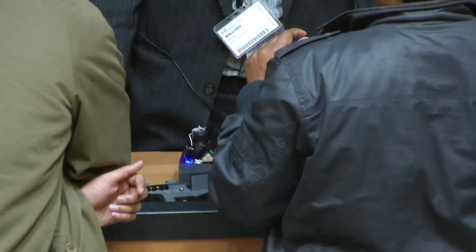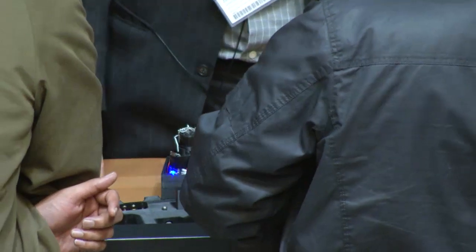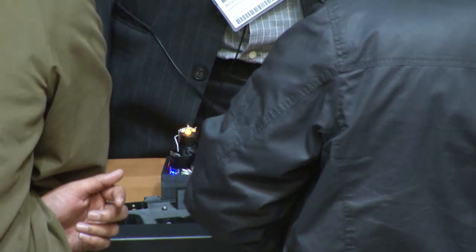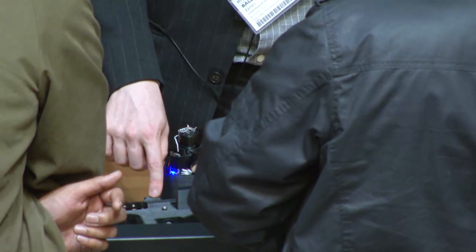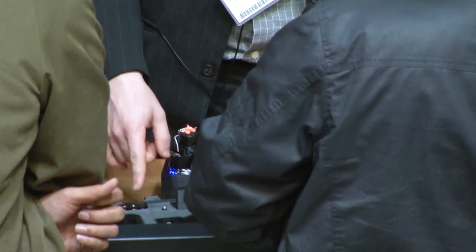In case I just want to use my smartphone, and it has a lens, do I need to remove that? Sorry, so you're asking about decapping the lenses from the cell phone. These are designed to incorporate the lens that's already in the phone into the design. So we did not decap the lenses here. This works with any phone.